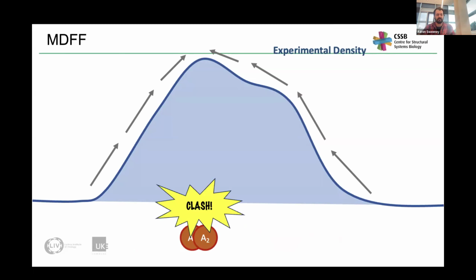Now, in practice, the clashes usually don't happen because you have other additional restraints, right? This bond is usually explicitly modeled, so that stops this, but it's still a limitation of this kind of potential.